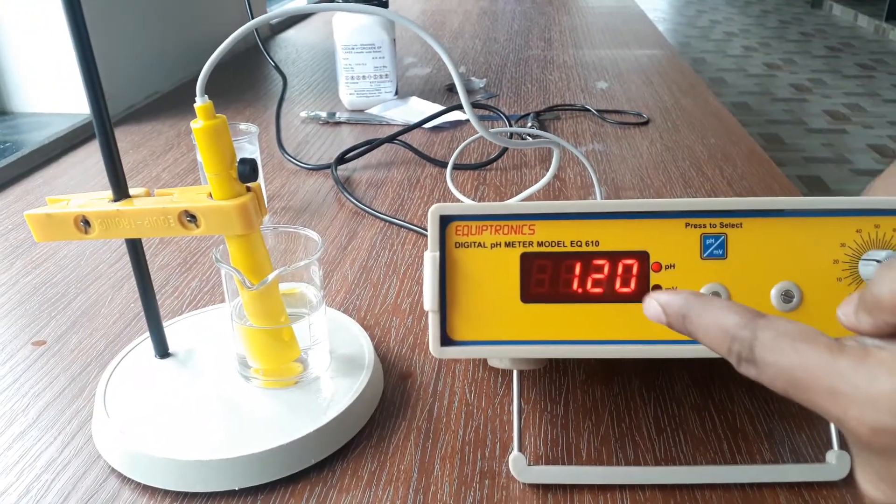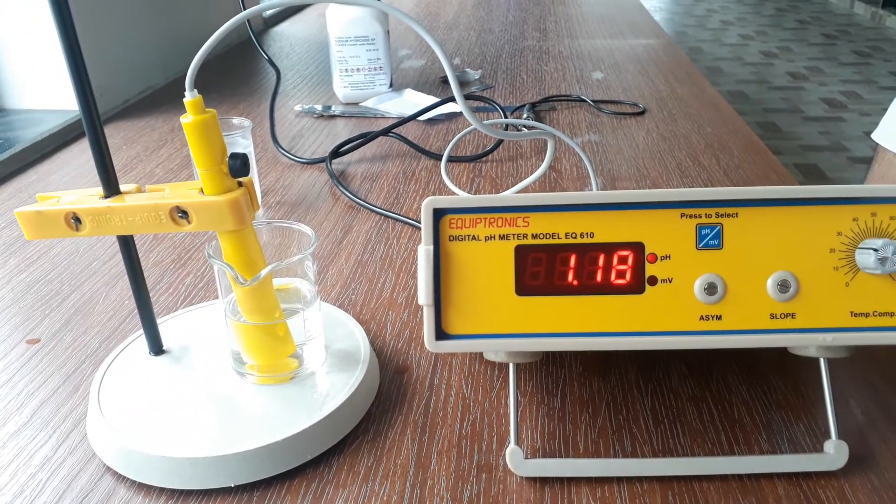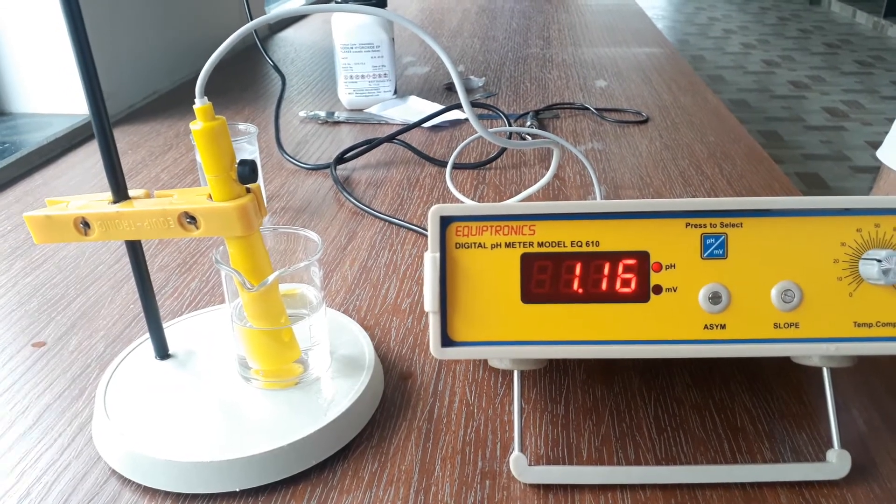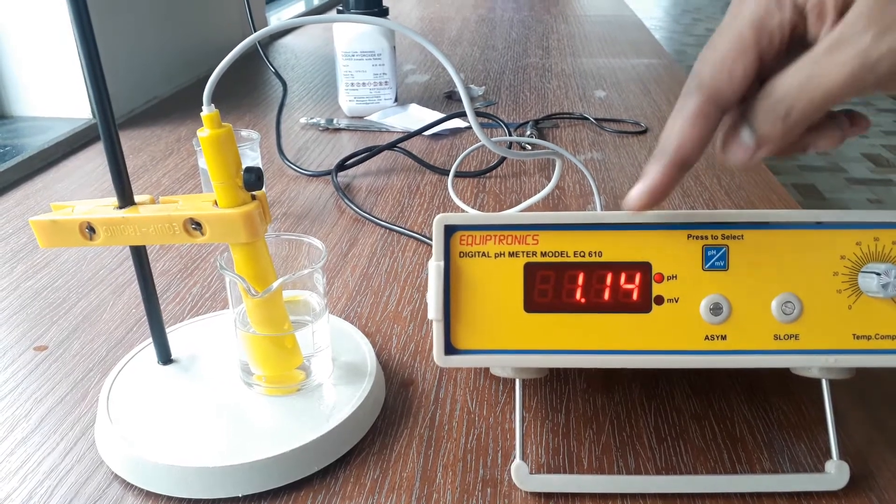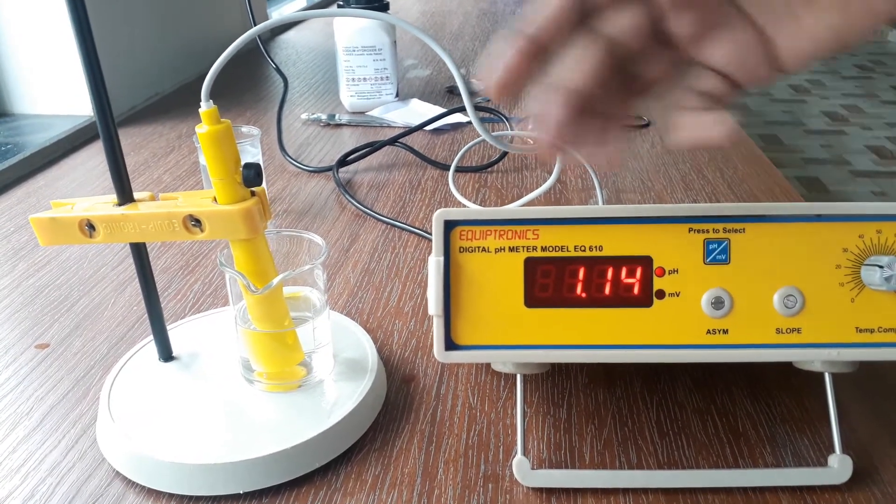Now you can see immediately the reading has changed, 1.9, 1.18. So if it was an unknown solution then you immediately came to know that it is acidic and you also came to know its pH 1.14.